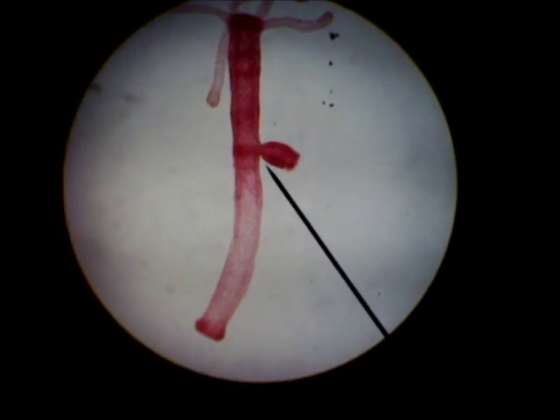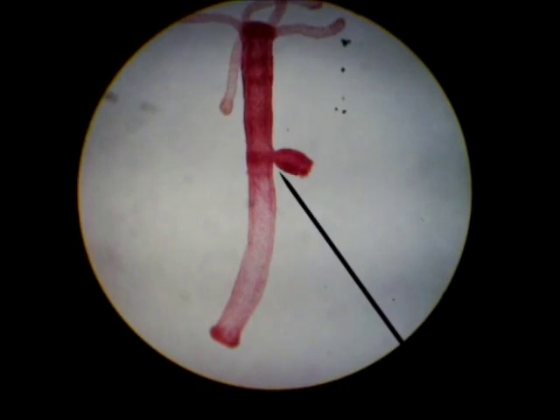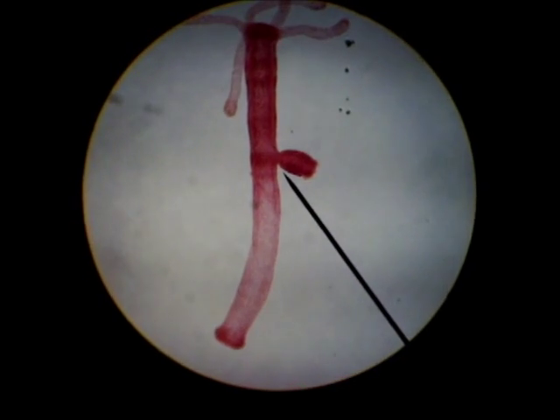Here's a Hydra with a budding Hydra. Once again it's Phylum Cnidaria, class Hydrozoan. This budding Hydra represents an asexual form of reproduction.